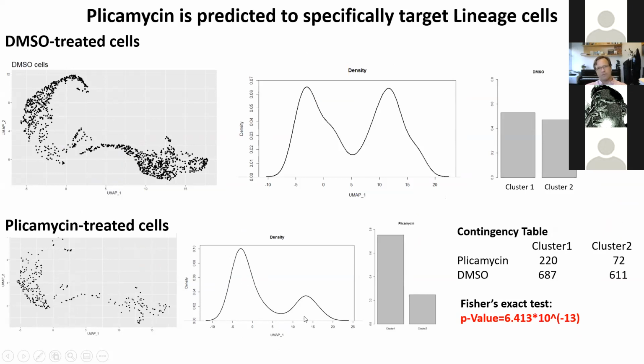This is after 24 hours of therapy. You can argue that either some of the cells in this cluster have died or that they have changed their transcriptional state. I tend to favor the latter interpretation, but this is early days, an N of 1 on this type of study. But this gives you an example of the type of work that can be done.